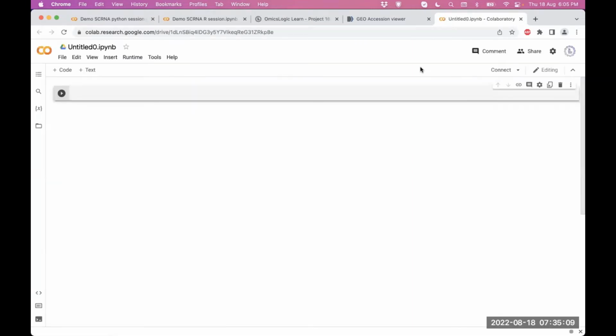So everybody start working along with me. We need to do this before even starting to get an idea of what we are going to discuss today, because some of the packages that we need to use will take a long time to install, so that we can manage our time effectively by running through these installations before even starting to use this notebook.